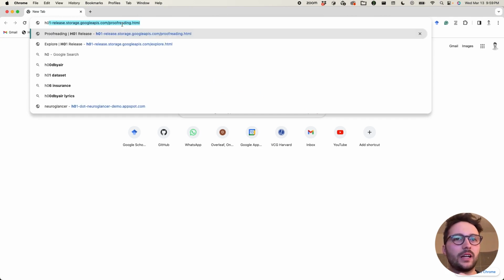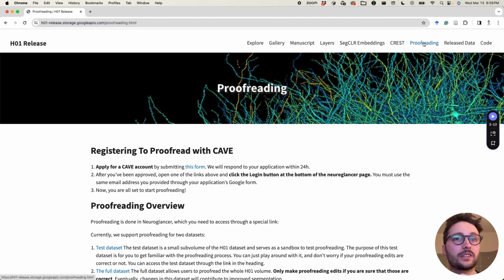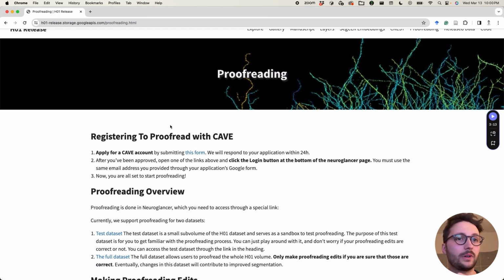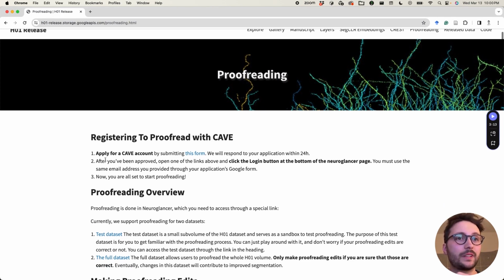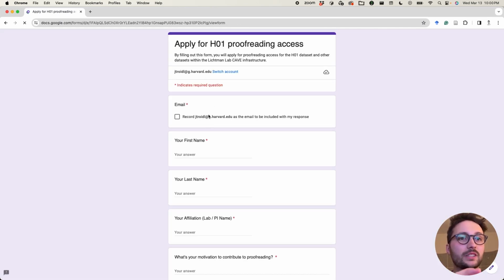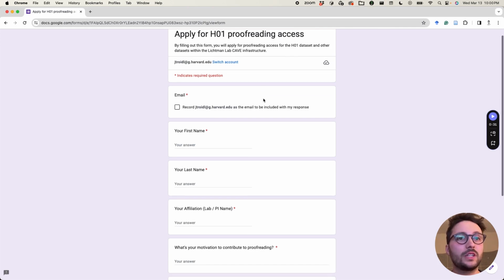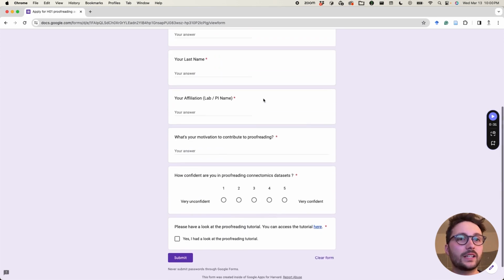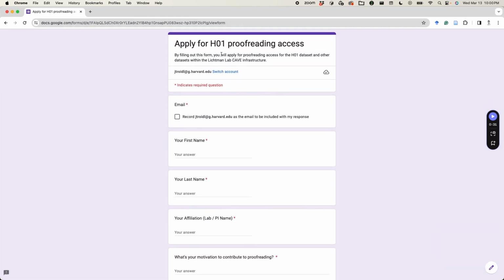So first, you'll have to go to the H01 website, and under the tab called Proofreading, you'll find a detailed written tutorial with instructions and everything that I'll also show in this video. But before you can start proofreading, you have to click on this form and answer a bunch of questions, and we'll usually get back to you within 24 hours, and then you are all set to start proofreading.